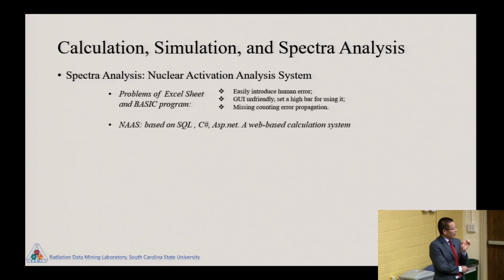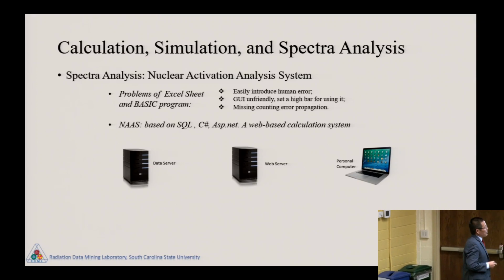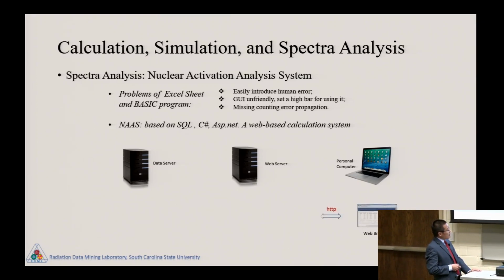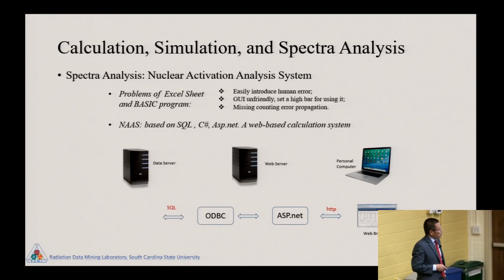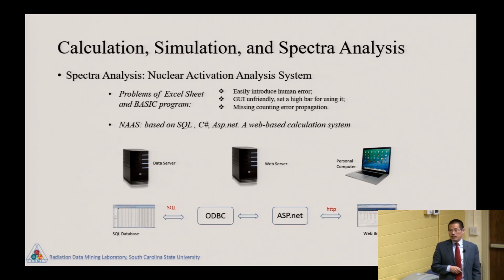It's a web-based calculation system. Basically, we have a data server, a web server, and your personal computer. Your web browser contacts the web server with ASP.NET, and then uses an open database connection to connect with the SQL. All the calculations are done on this data server. The data server feeds back to the web server, and then you can see it on your personal computer.